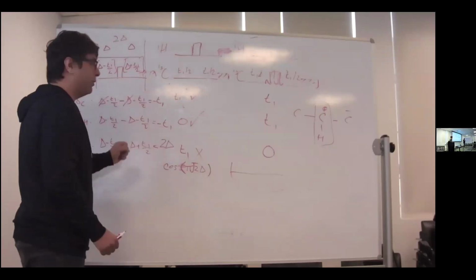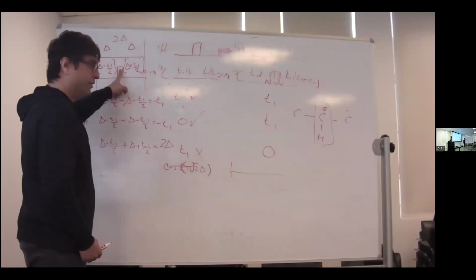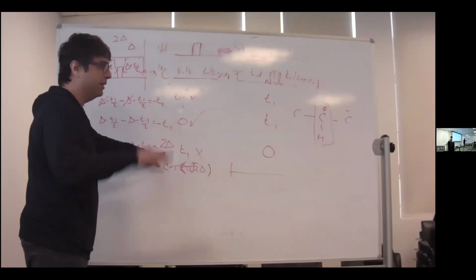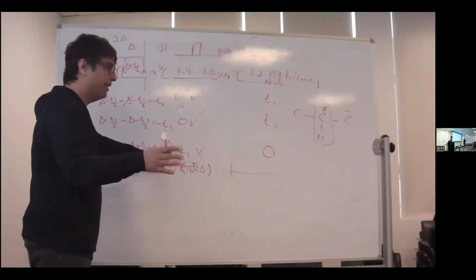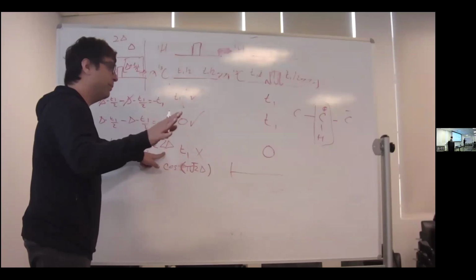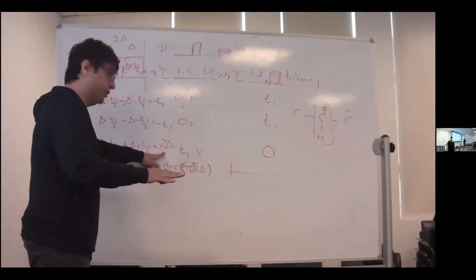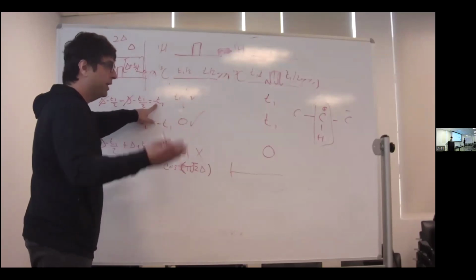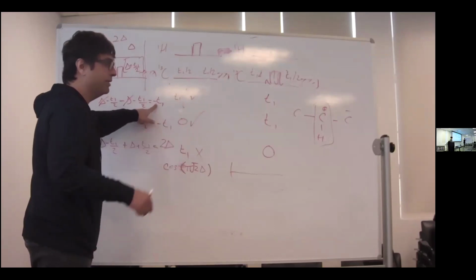Alright, so let's run through it. Let's say T1 equals 0. My pulse is here, and nothing evolves except for the J couplings. But we set the delta to be 1/2J, so we get no J coupling evolution. The intensity is 1, everything is good. Next experiment, I set T1 to be 0.1 millisecond, or whatever.